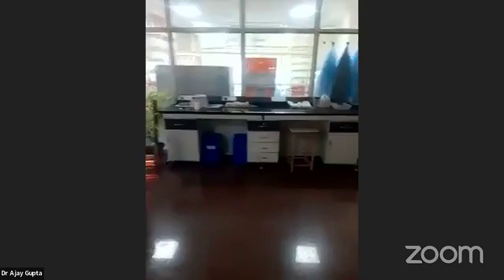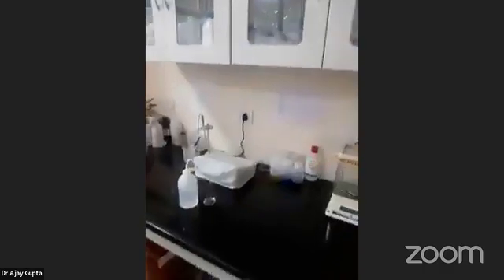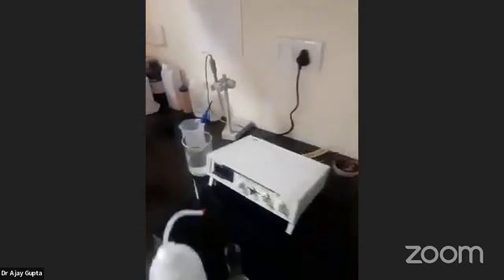So this is the media room. We have different kinds of nutrients and chemicals which are used to prepare the media, that is, nutrition for the plants. Using a balance and a pH meter, the media conditions are set.